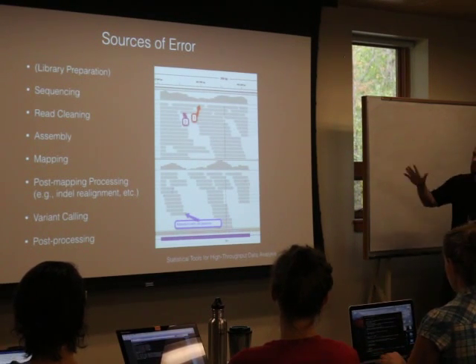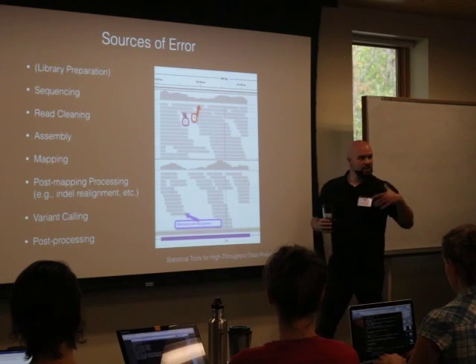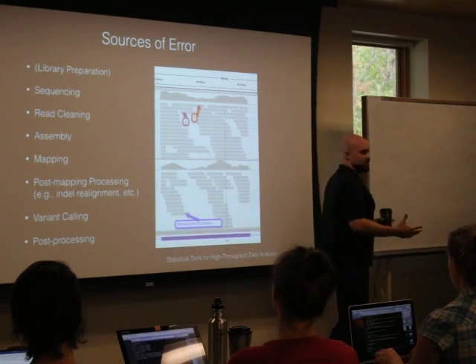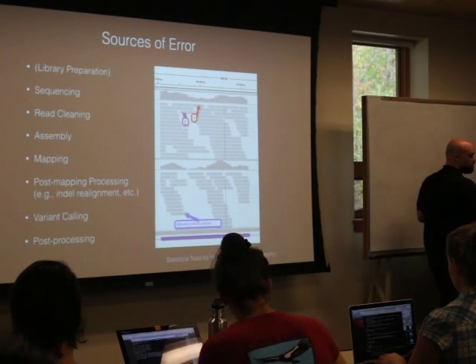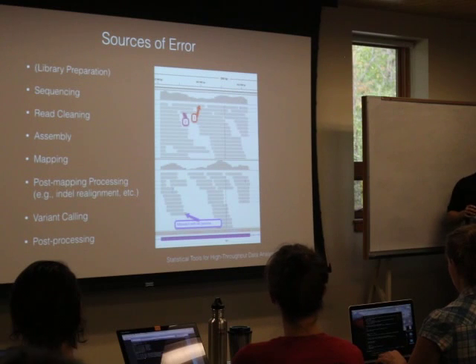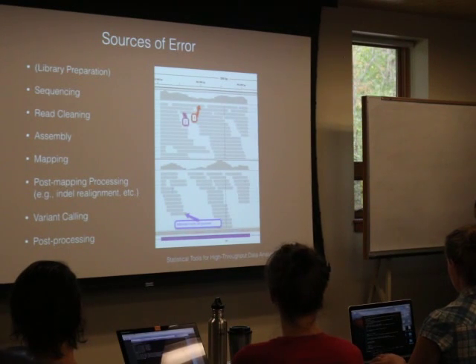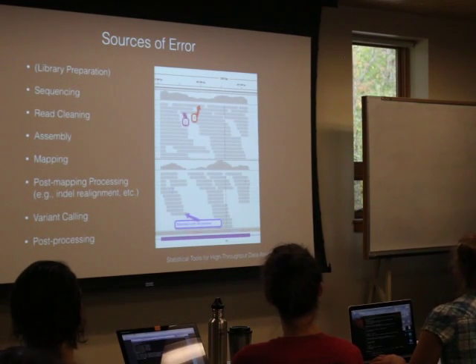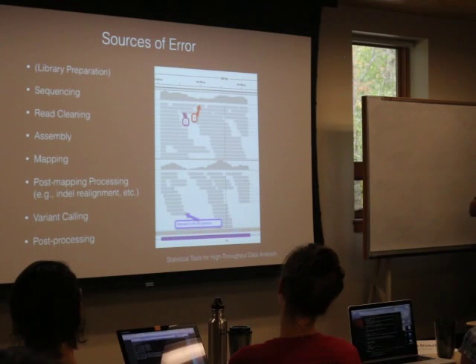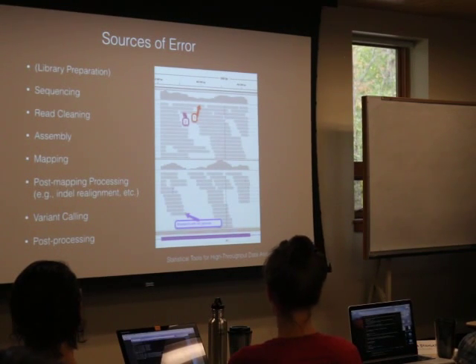Now, if you don't have a genome, or you don't have anything that can be treated as a reference in a general sense, you might want to do a little bit of assembly to get some sort of reference genome. So de novo assembly of particular targeted regions that might be of interest, or using transcriptomes, if that was what was used to generate your target sequence, like Jeff just spoke about a little bit. You can assemble those transcriptomes and then go back and map to them and call variants.